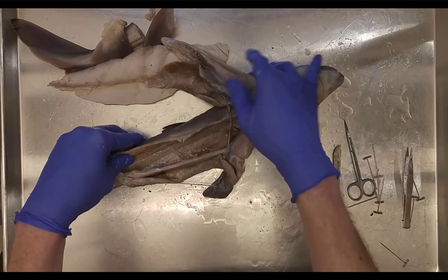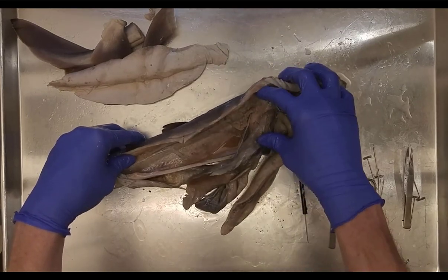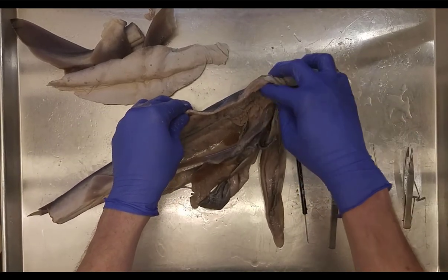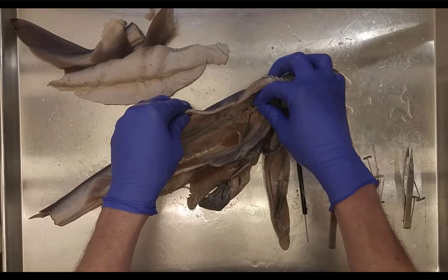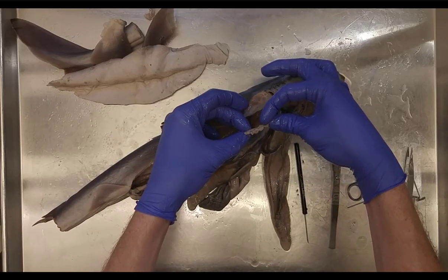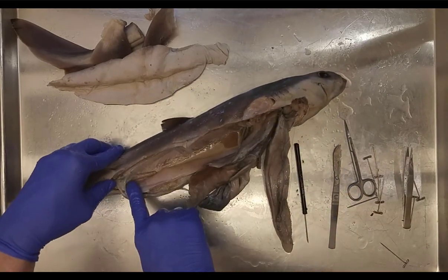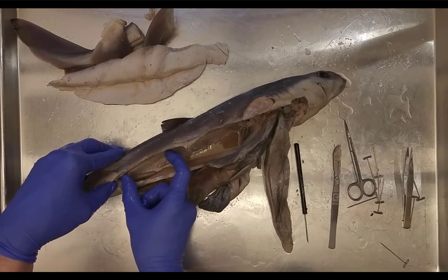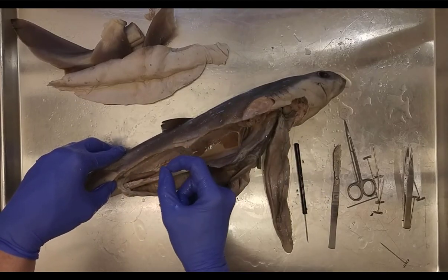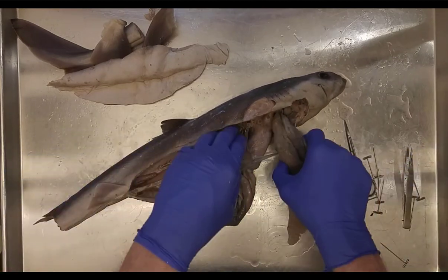This is a female, so we should see female reproductive organs. This one is immature, so not much is going on. The immature ovaries are up here. In a mature specimen, the reproductive organs fill the entire cavity, and you'd find juvenile sharks and large egg yolks farther down.